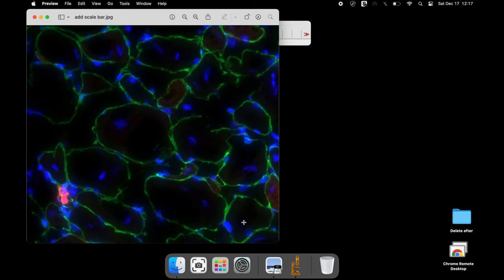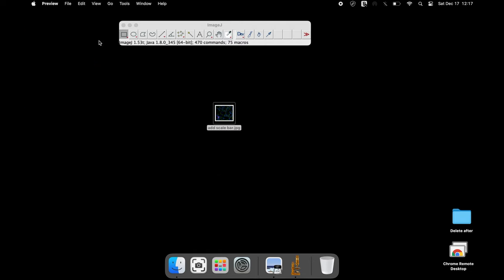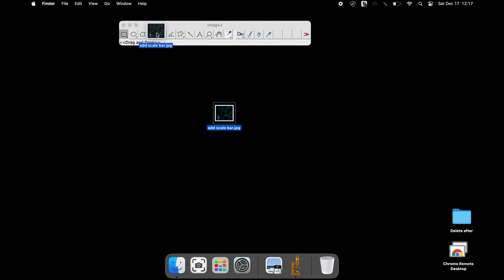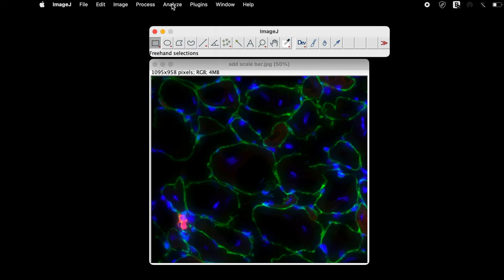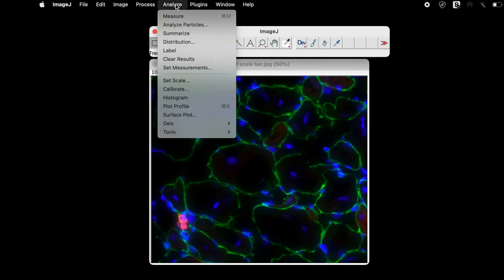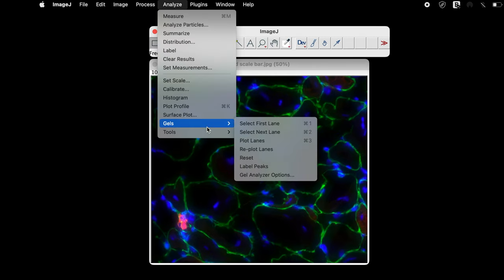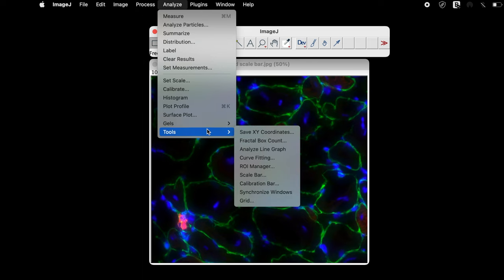Let us launch the ImageJ software and open the image of your interest. To set the scale bar, click on Analyze, Tools, and Scale Bar.